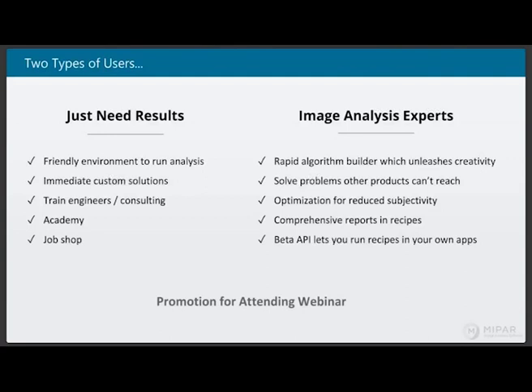With the color deconvolution, you just circle the orange, and it spits out the optimum channel operation. It might be something like 0.17 red minus 0.8 blue plus 0.3 green, and then your orange is lit up, and it's a simple thresholding problem to find the orange. So that definitely could be a powerful solution for the mineral quantification.